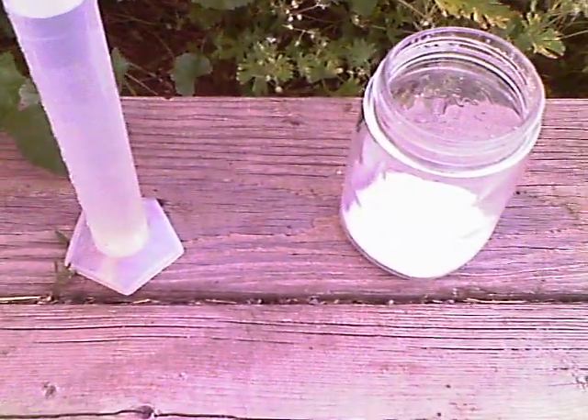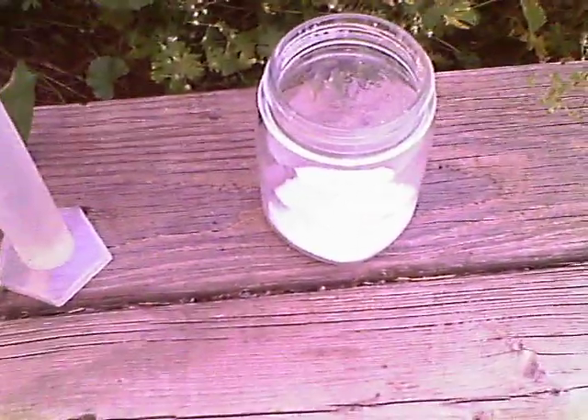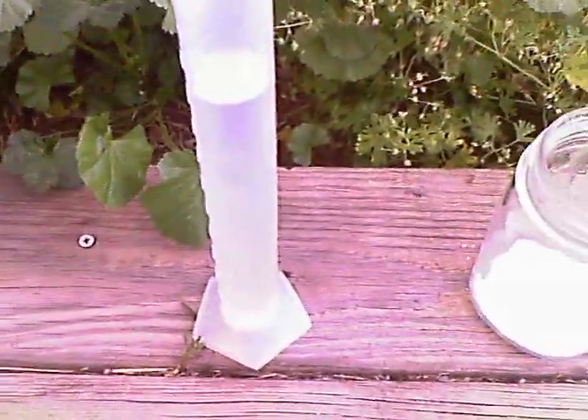Hello, welcome to 42SuperNerd. Today we'll be making magnesium chloride and sodium sulfate. And here we have 100 milliliters of Epsom salt solution.